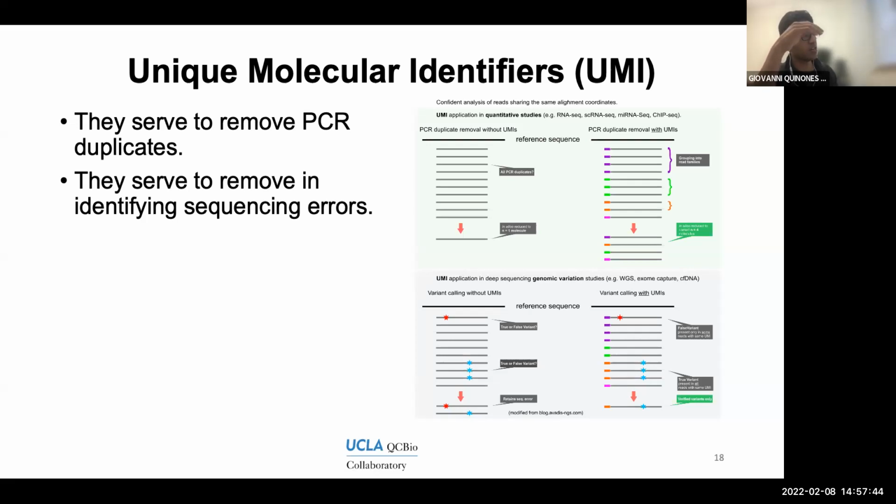We'll talk about Smart-seq, which can generate very deep sequencing libraries for individual cells. Roughly speaking, the range is from a few thousand to a few million, depending on how much money you want to invest. Okay, great question.